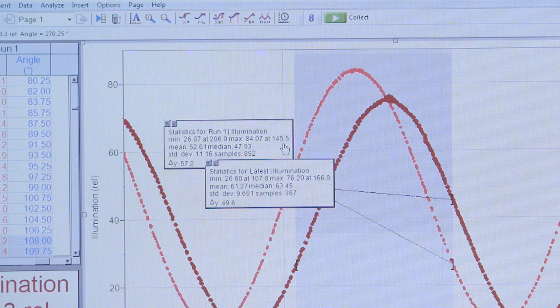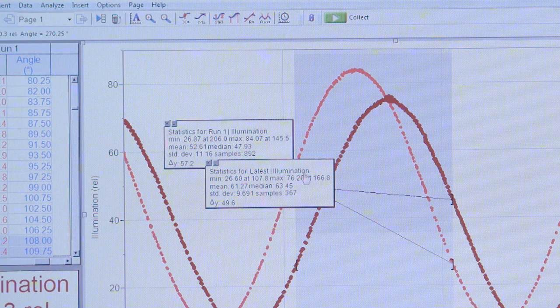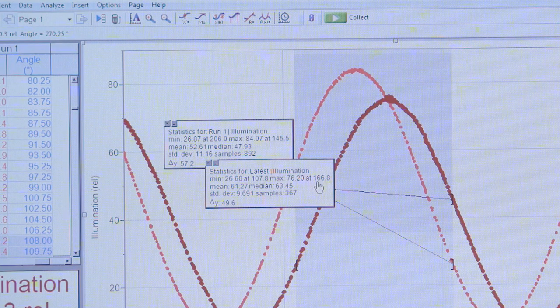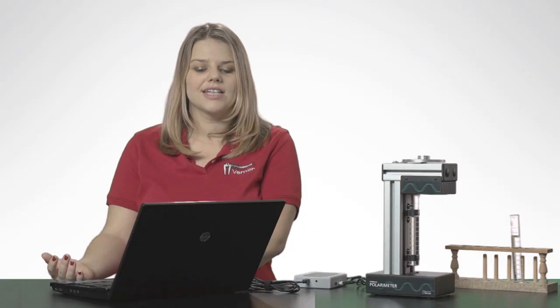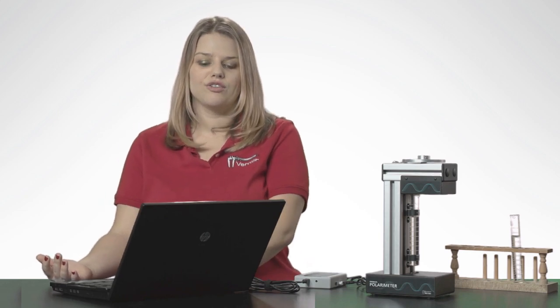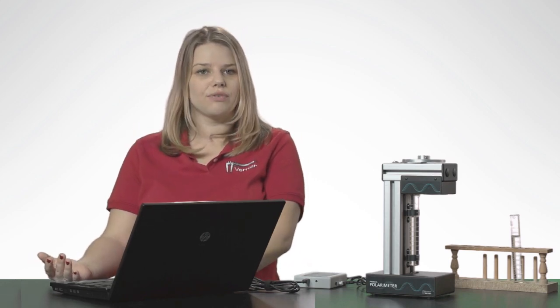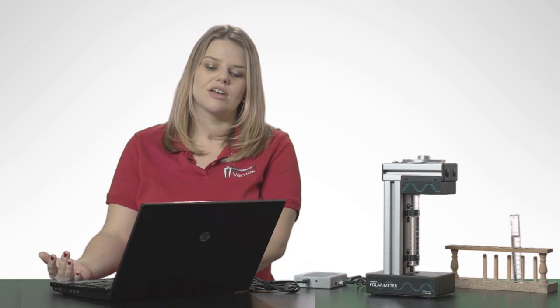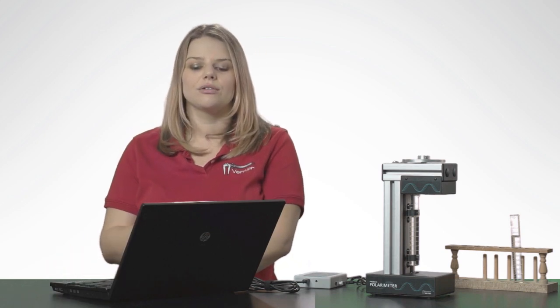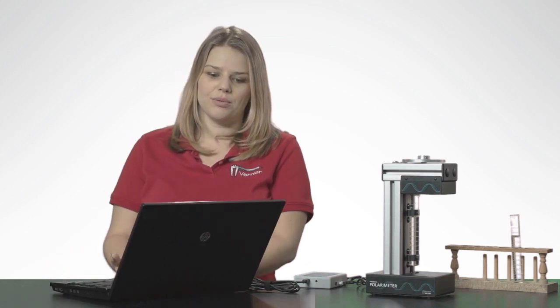For the blank, it's 145.5, and for the sample, it's 166.8. To get the optical rotation of my sample, I just take the difference between those two values, and then I can use that value for further analysis of my sample.